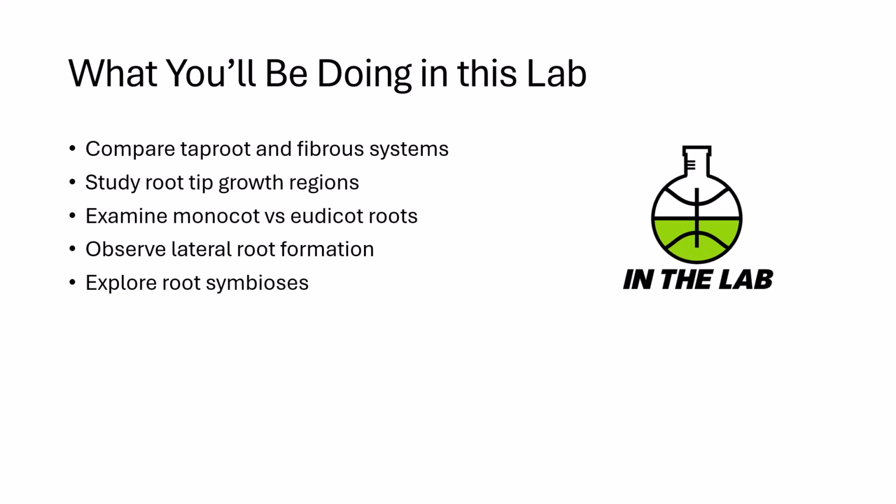Throughout the lab, you'll be making careful observations, creating lab drawings, and connecting what you see under the microscope to how roots function in the real world.